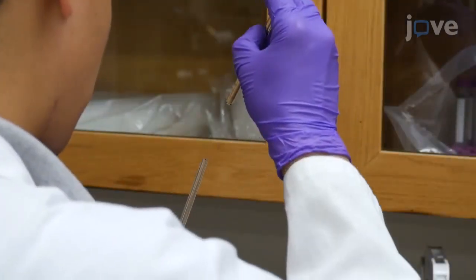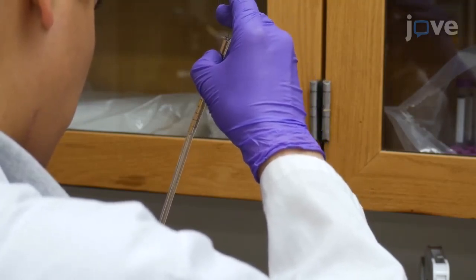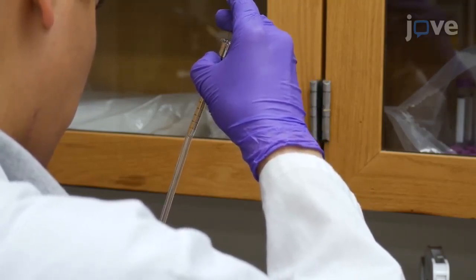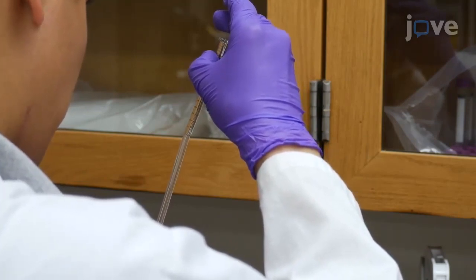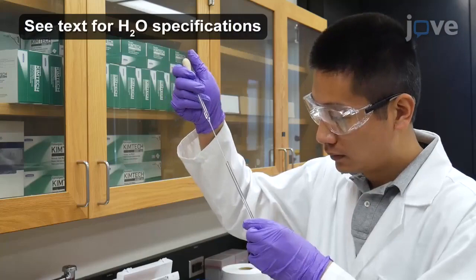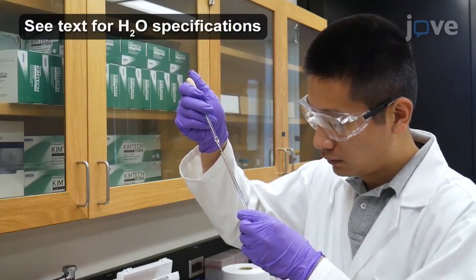If any of the starting organic compounds are liquid, use a microliter syringe to transfer it into the tube. Using a Pasteur pipette, add the pre-weighed materials. Then, add deionized and deoxygenated water.